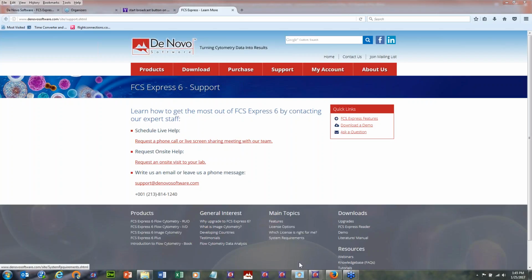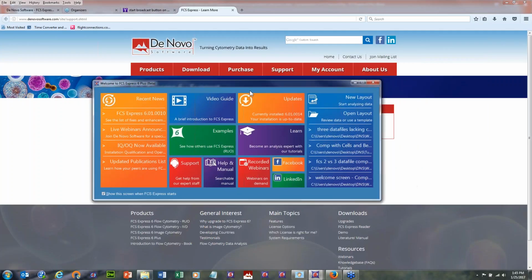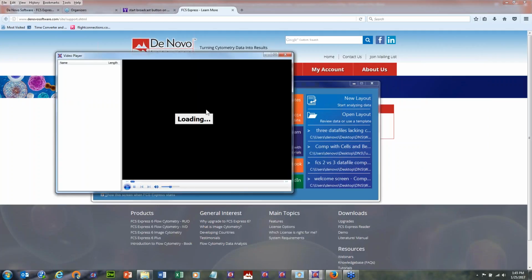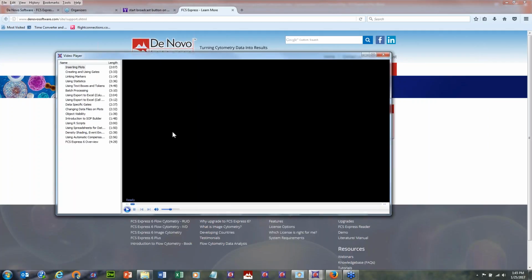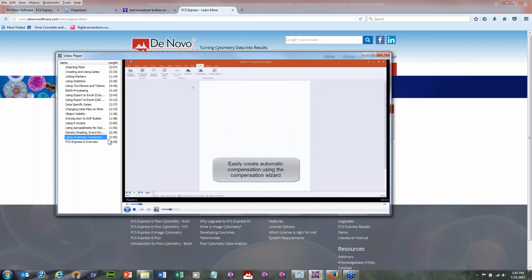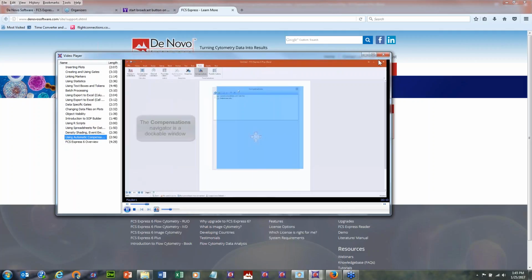Okay. We also have other help resources. If you have the software open, you can click on Help and Manual down here, and that will launch a written version of our manual. And we have the video guide up here. So if you click on Video Guide, it's a bank of short 2 to 4 minute videos. I believe there is one here all about compensation. It's the second to the last one. And that'll go through in about 3 minutes, just launching that 5-step auto compensation feature that I showed you.